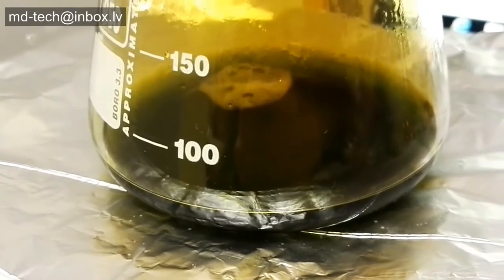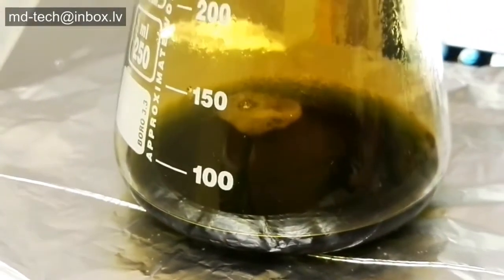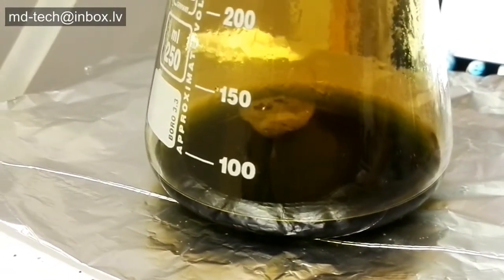Now that the gold and other precious metals are in a clear, filtered aqua regia solution, the dissolved gold and other metal chlorides can easily be separated from each other using a couple of different gold refining methods.